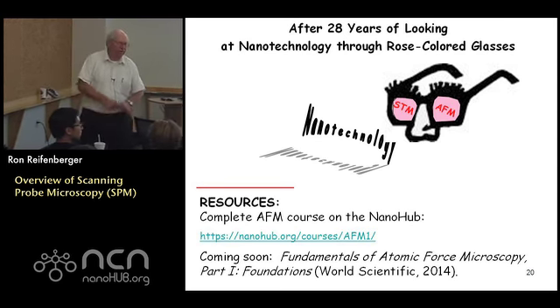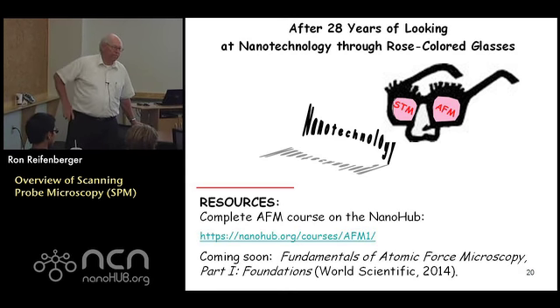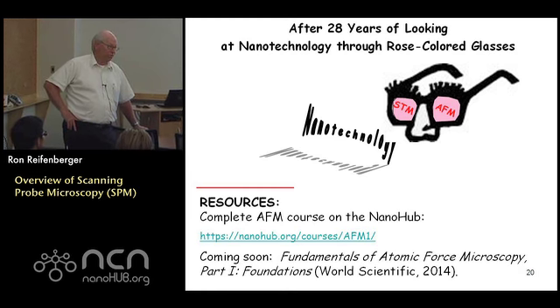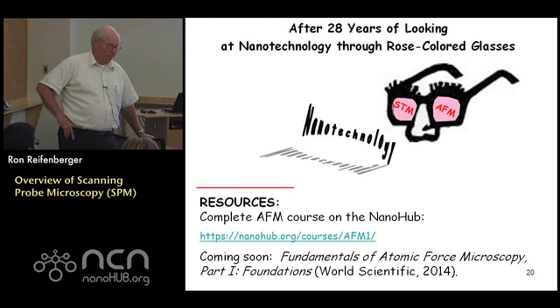Is the resolving power of these scanning probe microscopes basically set at one atom because you're detecting with just one atom at the tip, so you can't go much smaller than that? That's correct. The best you can do is 1 atom resolution. Okay? There have been some claims that you could use the AFM to resolve the chemical bonds between atoms in the substrate. Those chemical bonds are very directional, right? And there have been some claims that those have been imaged, but I don't think that's widely accepted.